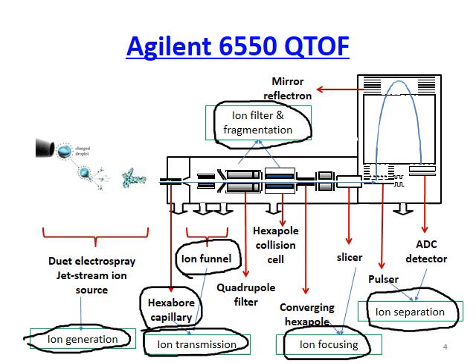These 2 parts, they are highly charged. The reason why they are highly charged is basically to propel the ions to move forward. At the same time, they are going to get rid of those neutral molecules that happen to be introduced. Contamination in these 2 parts is also common, and the contamination will affect both sensitivity and accuracy.